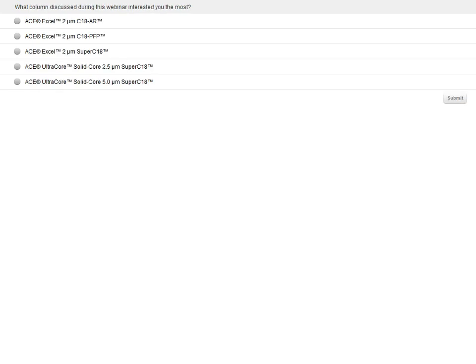All right, let's move to our next question. What column discussed during this web seminar today interested you the most? The ACE Excel 2-micron C18-AR, the 2-micron C18-PFP, the 2-micron Super C18, the UltraCore solid-core 2.5-micron Super C18, or the UltraCore solid-core 5-micron Super C18. So again, click directly on your screen to answer. Which column discussed today during this web seminar interested you the most? We'll give you one more moment to answer.